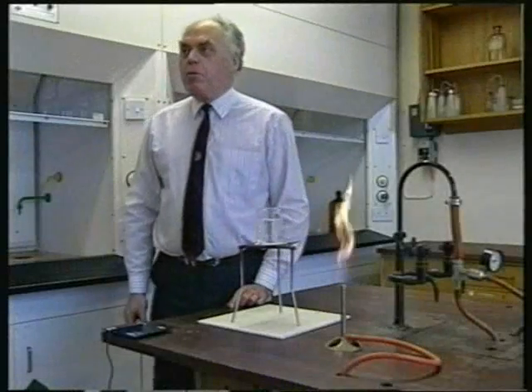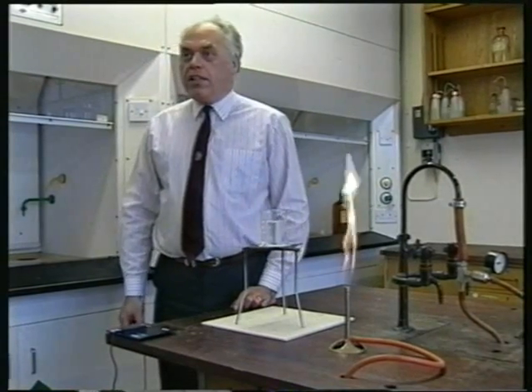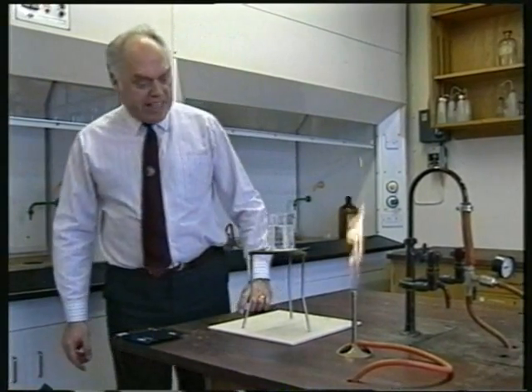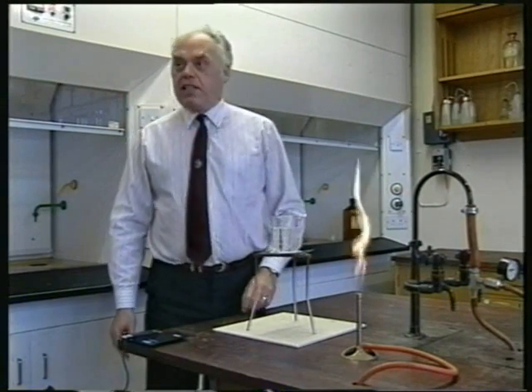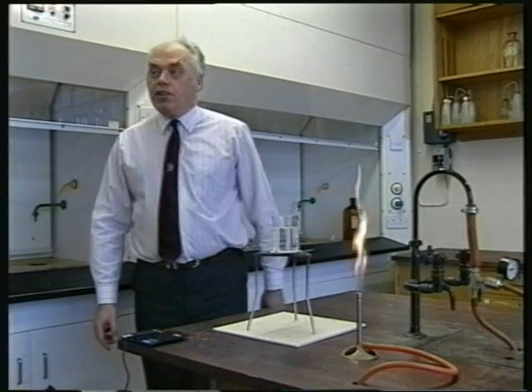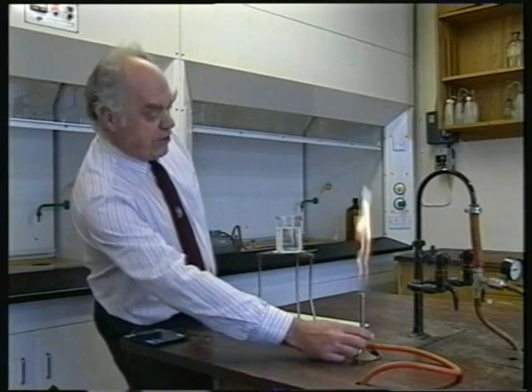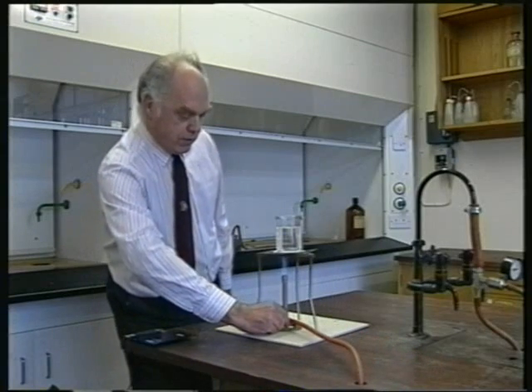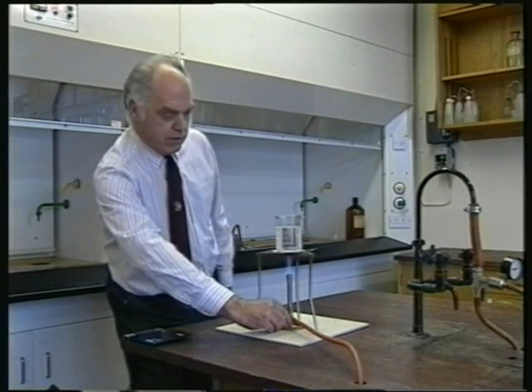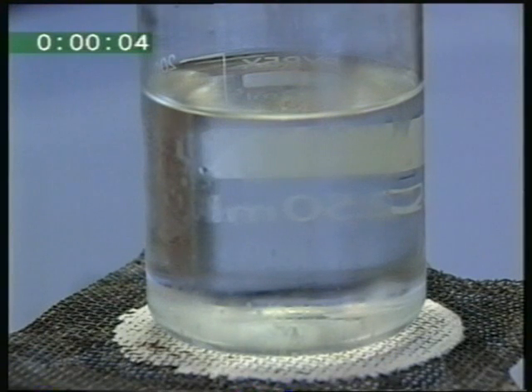Right, for this experiment, we're going to look very carefully at some water being heated until it boils. I want you to look very carefully, and I'd like you to try and explain why things are happening so that you can discuss it afterwards. Look carefully at the bubbles, if you can see any. You probably just saw the mist on the outside of the beaker.